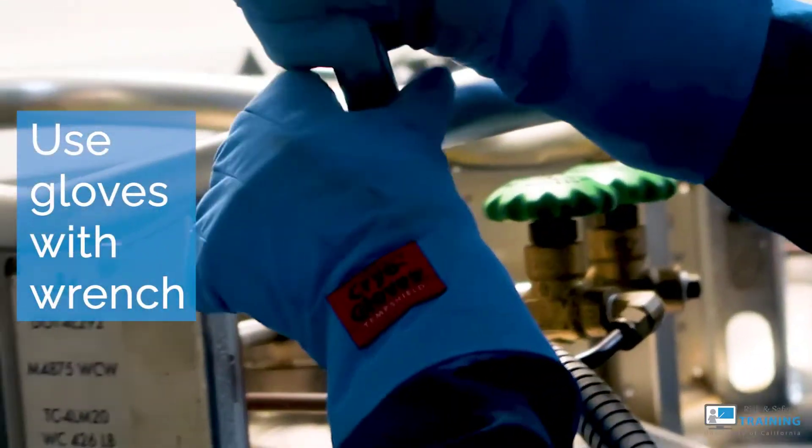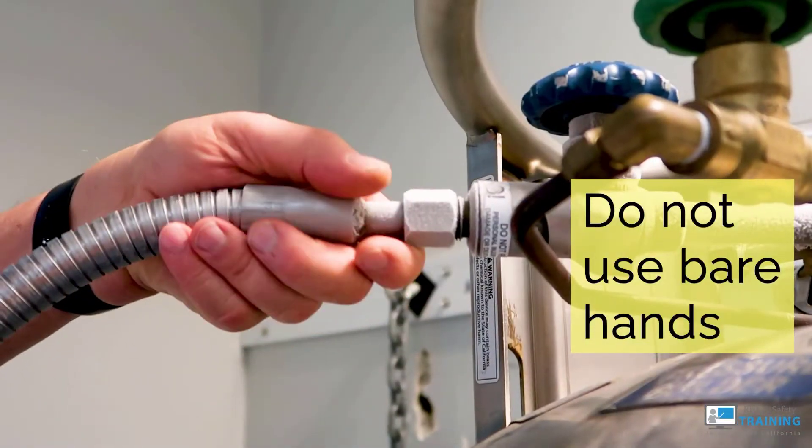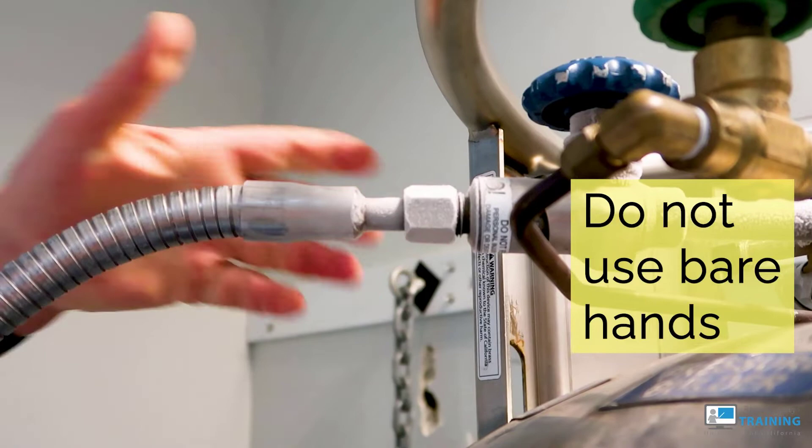Use your cryogenic gloves whenever handling a wrench. Do not use bare hands when touching the frosted transfer line. Damp, sweaty, or bare hands will stick onto the metal.